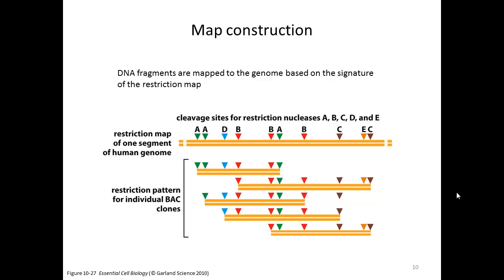So the way the plasmids were ordered was using restriction enzymes to cut the plasmids and produce fragments of certain lengths that then could be compared amongst the plasmids. Those are different lengths. When you saw fragments that were held in common here from the first two plasmids, you could see those overlapped, and so you could realize that this plasmid and that plasmid overlapped by a few fragments. You could also determine that these other three plasmids were completely redundant with these two, so you wouldn't need to sequence these other three.